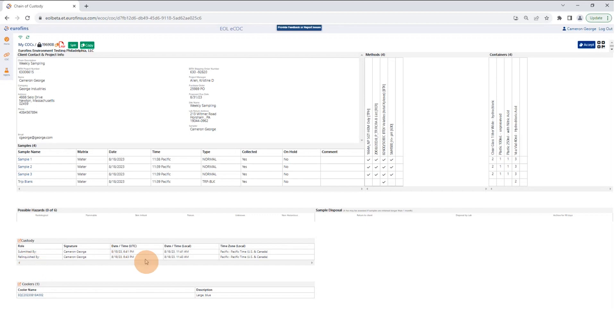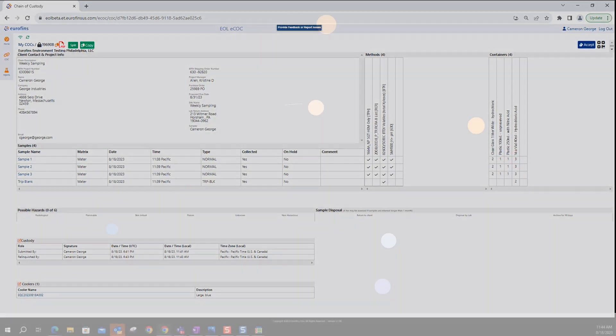After physically relinquishing the samples, the laboratory will proceed to log in the samples, and you will receive an email confirming that your submission and relinquishing was accepted by the laboratory.